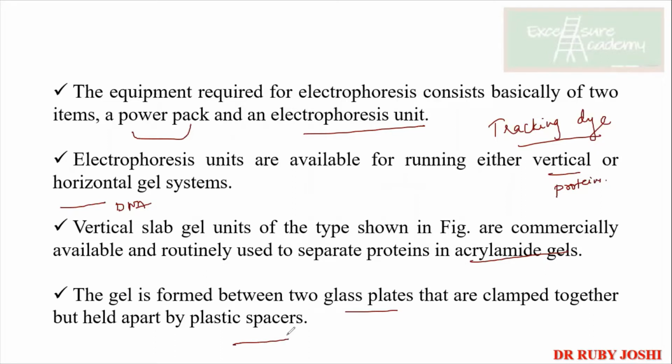Earlier, you needed to add these glass plates and clamp them. Okay, now it isn't like that, and everything is automated now. Now the plates are designed in such a way that they have the inbuilt spaces over here. Okay, the space is already given, and on top of this you can put another plate like this. So there is a gap between these two plates. Okay, now you need to clamp these. There is already a stand, you just have to place the plates in the stand, and that's it. Just on the top you can pour your gel, allow it to solidify, and it is ready.